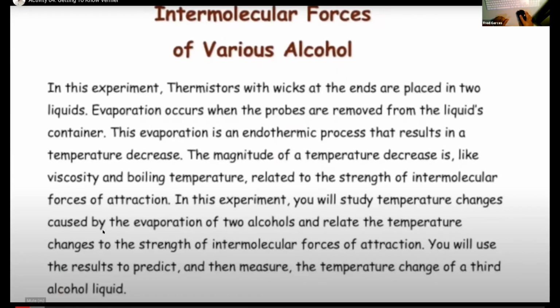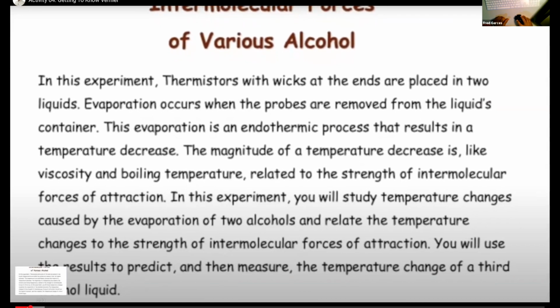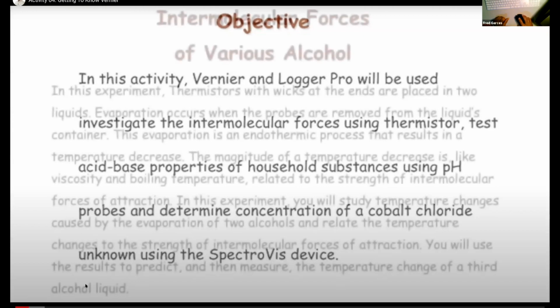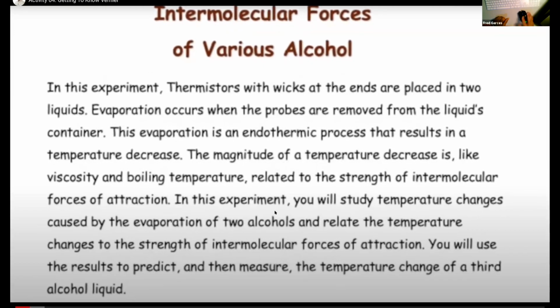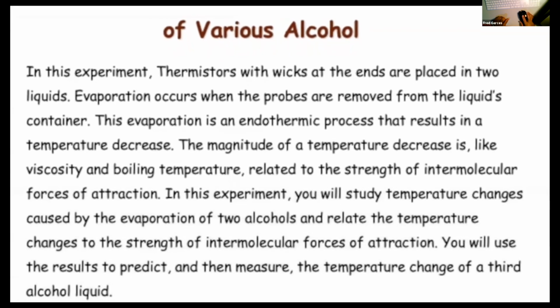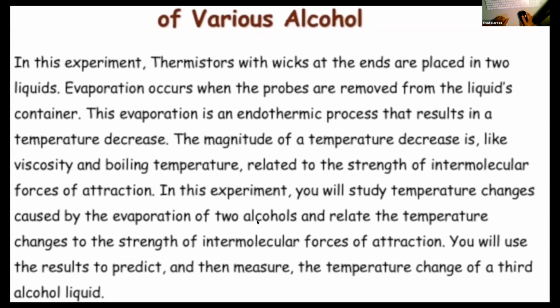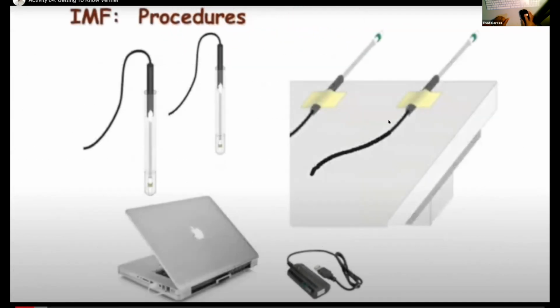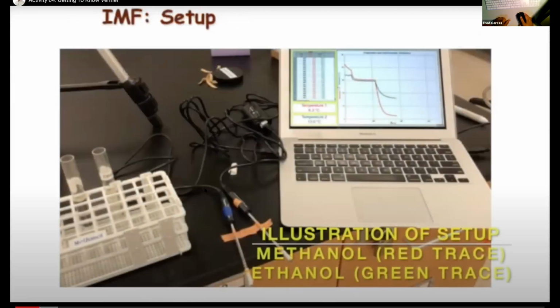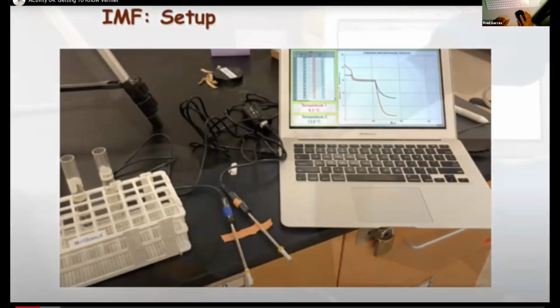I'm basically going to go through this. Read this introduction, because this is my PowerPoint. This one especially, because it pretty much tells the heart of what this experiment's about. You want to include this in your background information. These are the equipment that you guys are using: the computer, the temperature probe, and test tubes. This is what it will look like when you set it up if you were in lab.